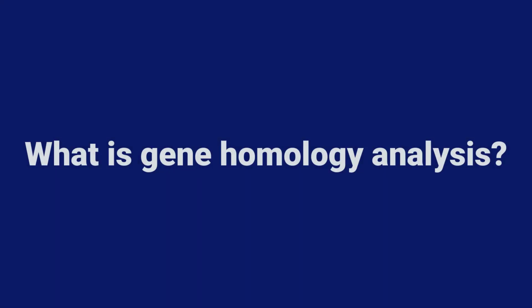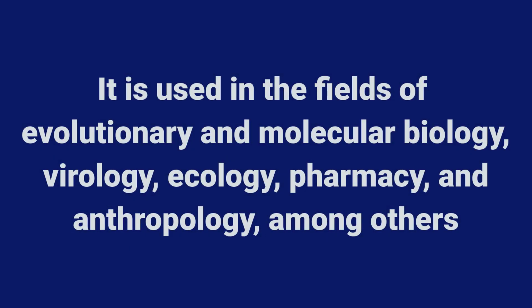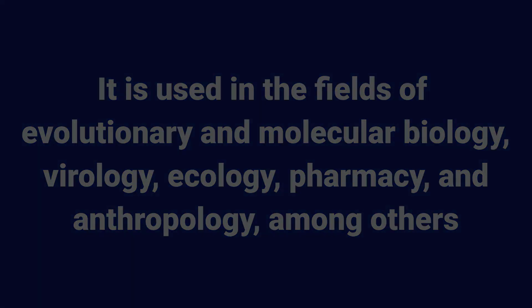Before I begin this tutorial, what exactly is gene homology analysis and who uses it? Gene homology uses DNA analysis to determine whether organisms share a common ancestor. It's used in the fields of evolutionary and molecular biology, virology, ecology, pharmacy, and anthropology, among many others.